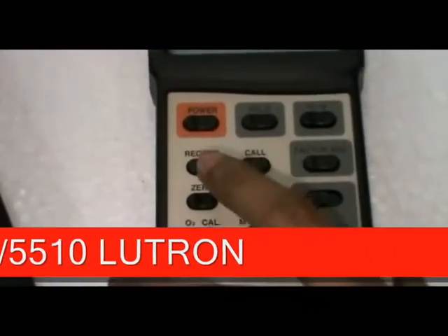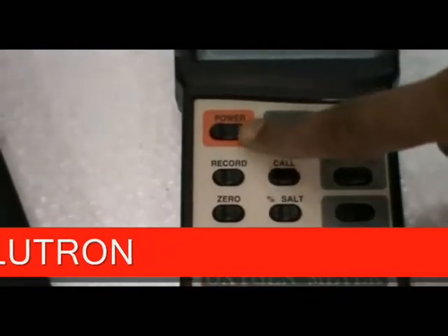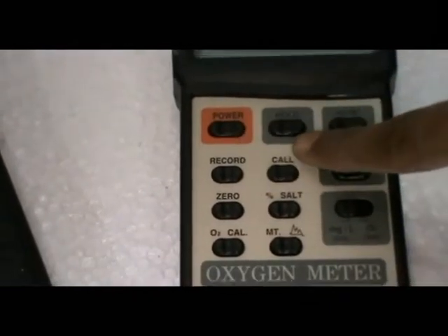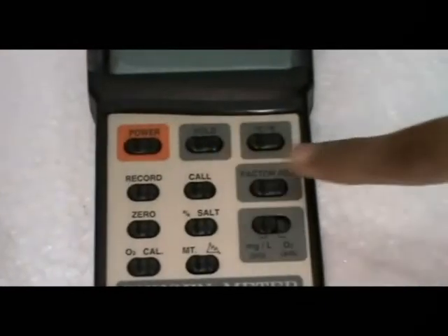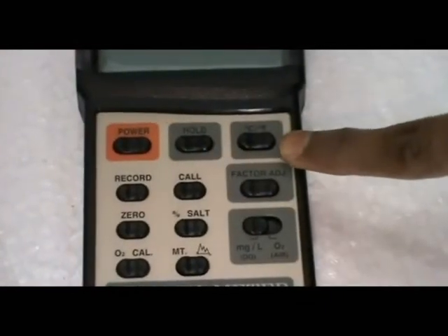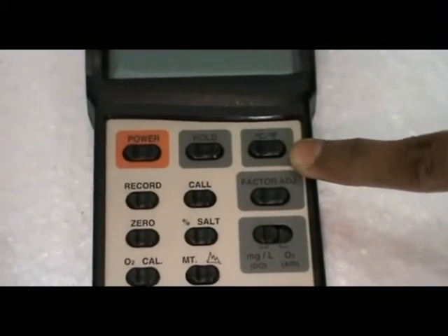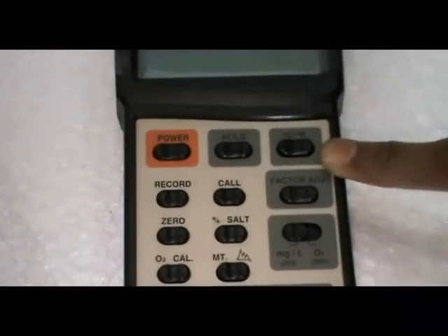Buttons: This is the power button. Hold button. Temperature button - it can show the temperature reading also.